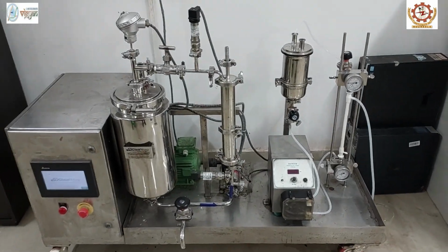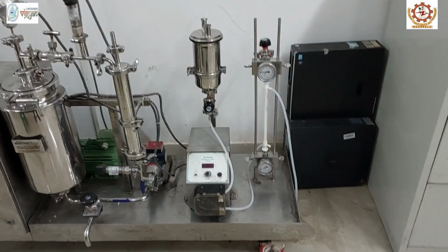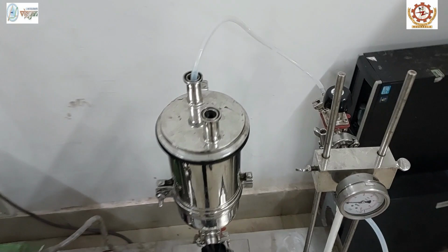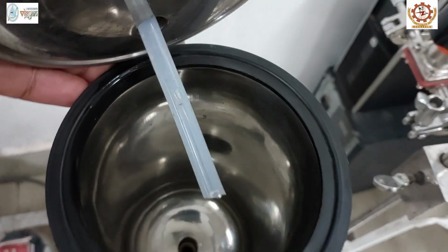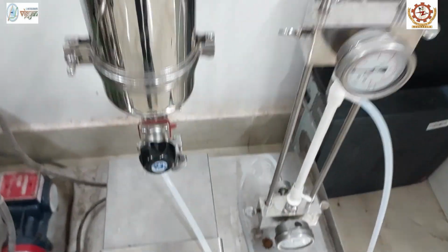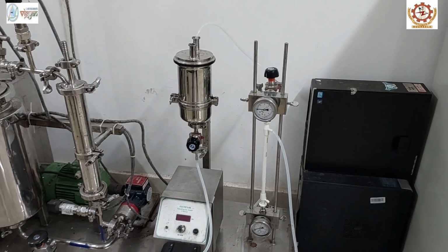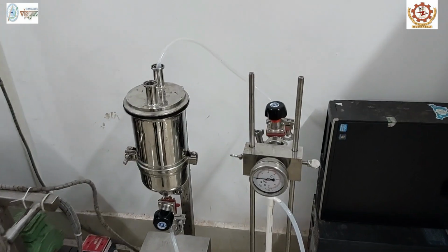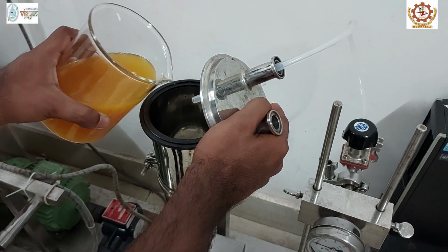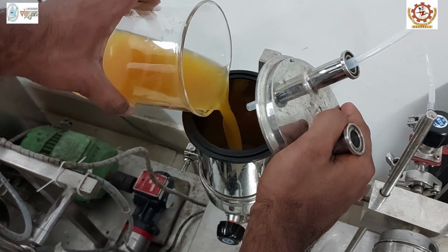Now we will see how clarification happens in fruit juice. For this purpose, we have initially removed all the water which was present in the feed tank. Now the feed tank is empty and the inlet valve will be closed. Once the inlet valve is closed, the juice should be fed into the feed tank. This is 500 ml of fruit juice, which will be fed in the feed tank for clarification.